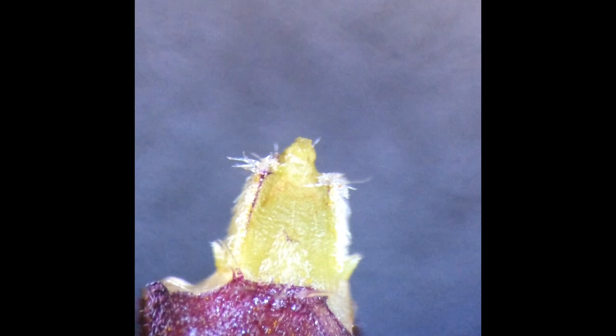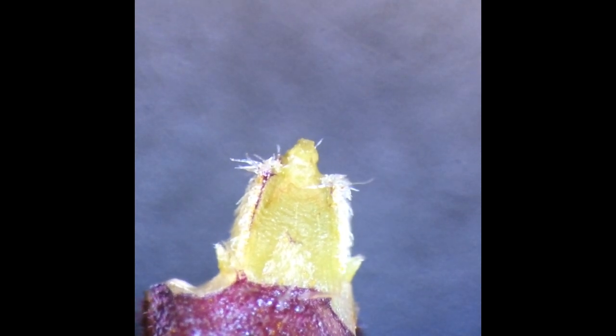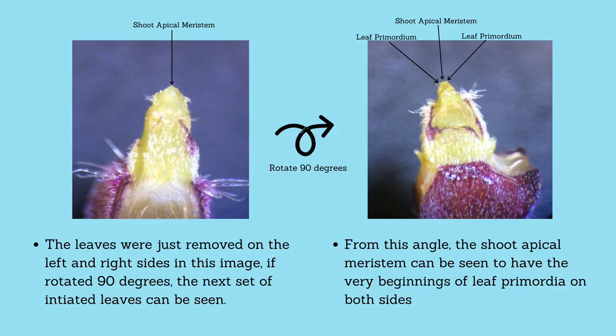Now I am going to rotate the shoot so we can see the shoot apical meristem from the other direction. You might have noticed that the shoot apical meristem looked more like a dome before we rotated it 90 degrees.